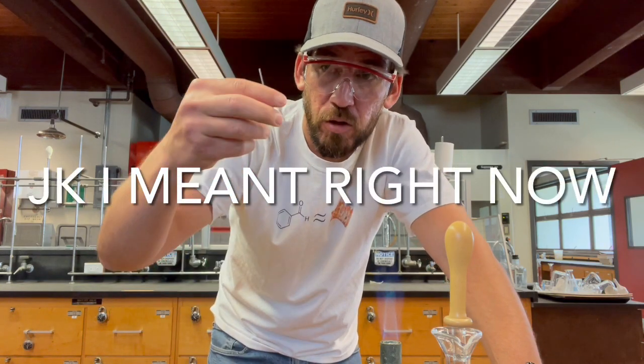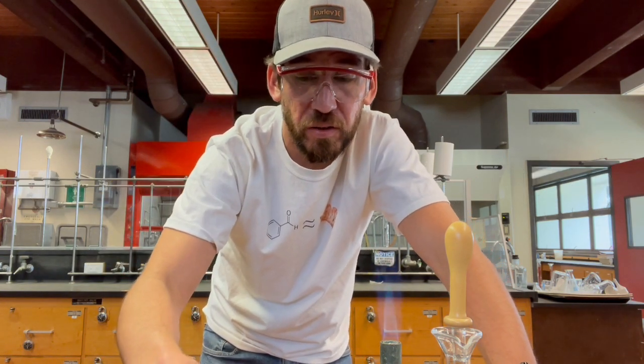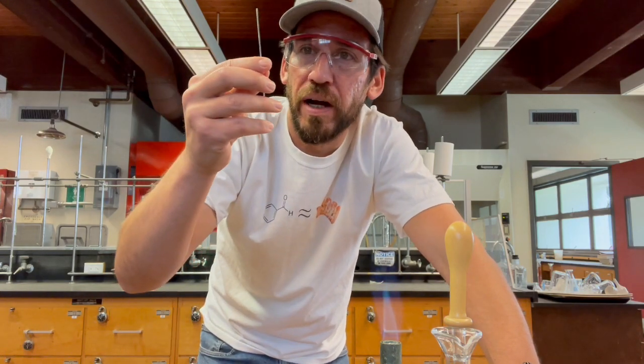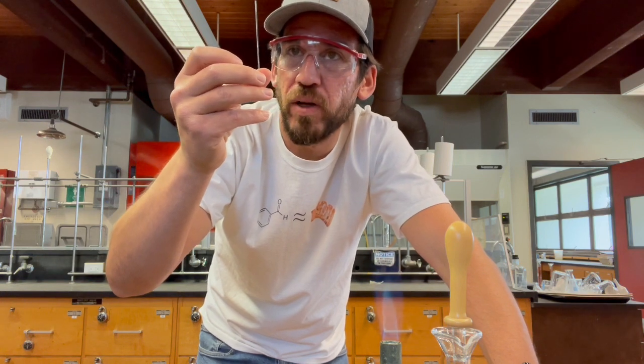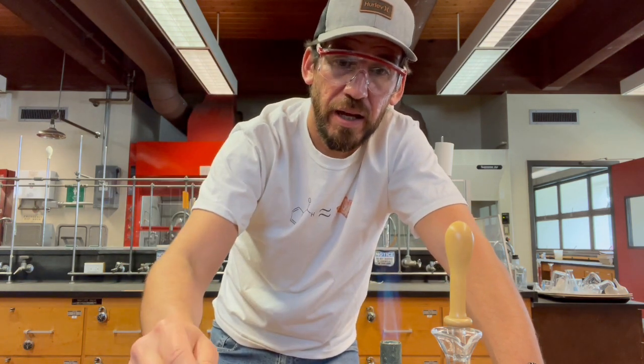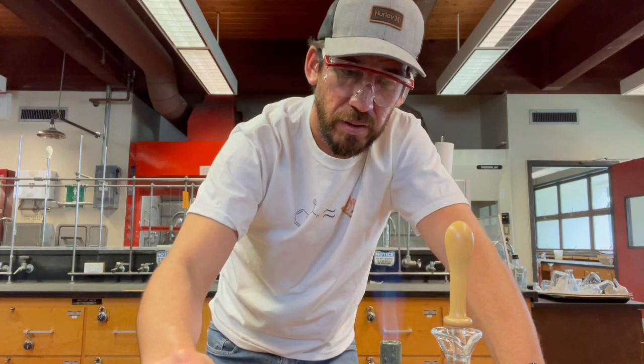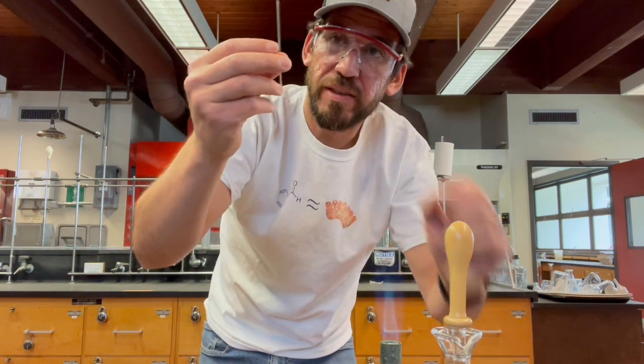You may or may not have done this type of boiling point in general chemistry or maybe intro chemistry or some other chemistry. But remember, the definition of a boiling point is the point at which the vapor pressure of the liquid is equal to the atmospheric pressure, and so it's going to start bubbling, and then it's going to go up. The gas inside of this capillary, this microbell, is going to come out, right? Because it expands. And then since it expanded, let's pretend my arms are the microbell. Once it expands and the bubbles start to come out, then you're going to turn off the heat to let it cool down.